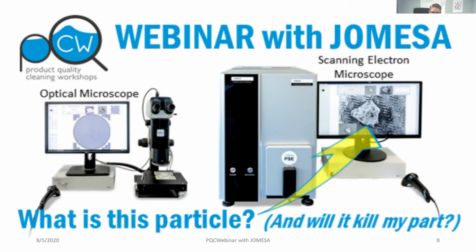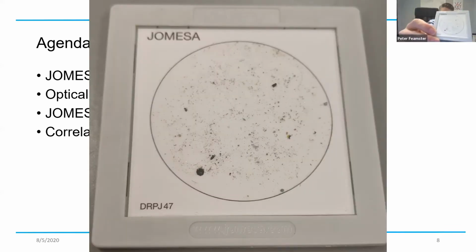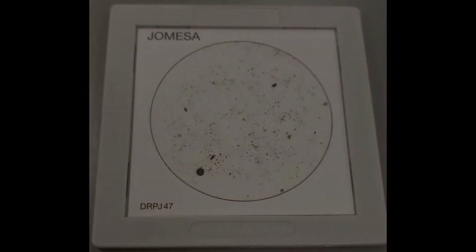And when you're talking about the analysis process, we're discussing extraction of contamination from a component after it's been produced to come up with a filter membrane sort of like that. So you'll have a thin filter that has all of the particles and contamination that's extracted from any given component. And this is what we analyze.